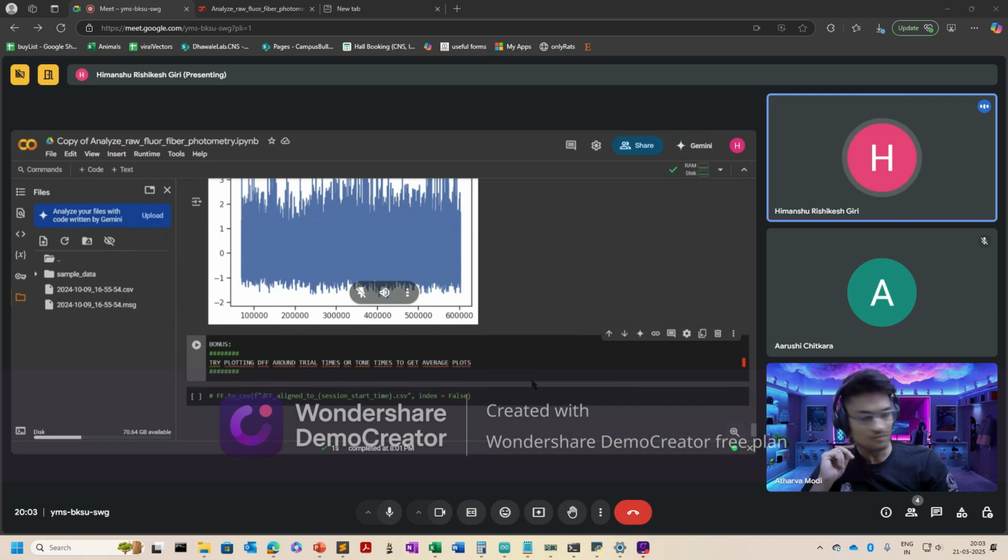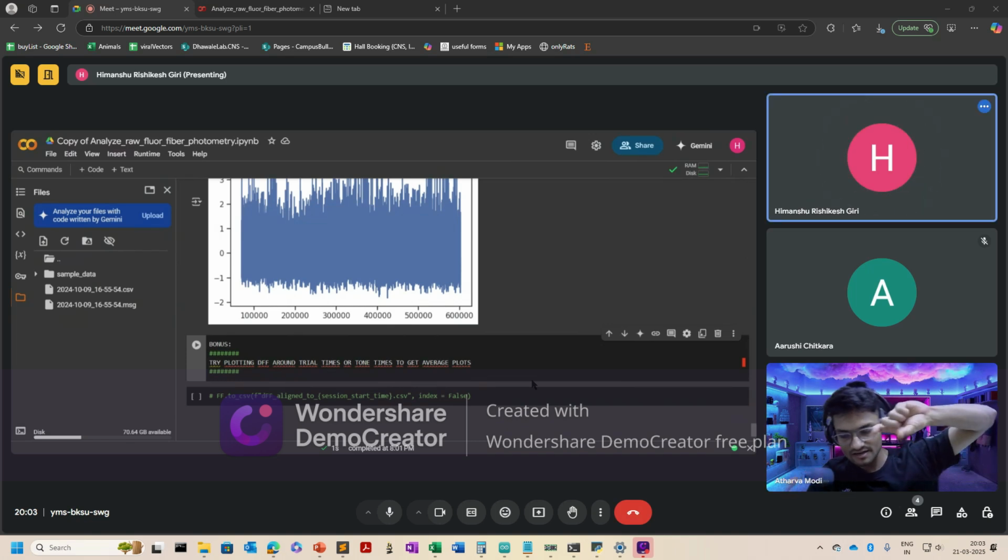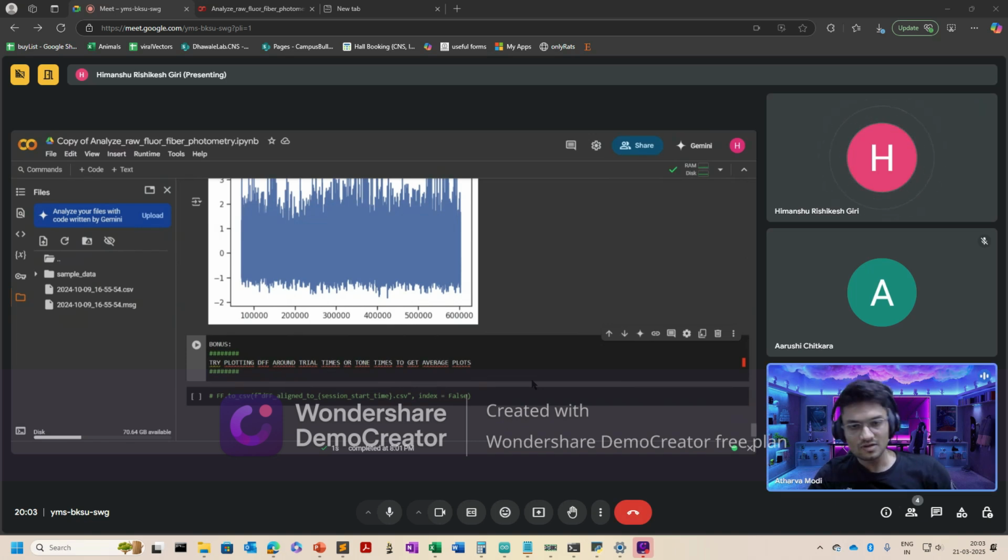The release pattern may be different for different neurotransmitters, or it may look sort of like an action potential. If you do calcium, it may look like a very extended action potential. But dopamine also has a particular release pattern in this region. In other regions it may be different, but in the region that I have recorded from, it increases very sharply and then decreases slowly. So it will look like an action potential. The first one also looks like that. But since it is trial averaged, it is just the probability of that peak occurring at different points. You get it?